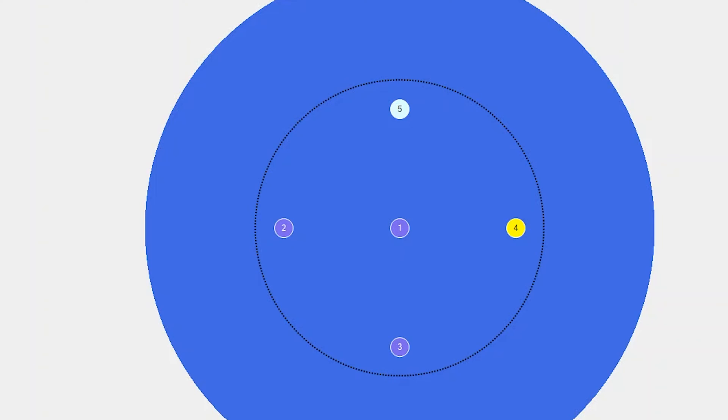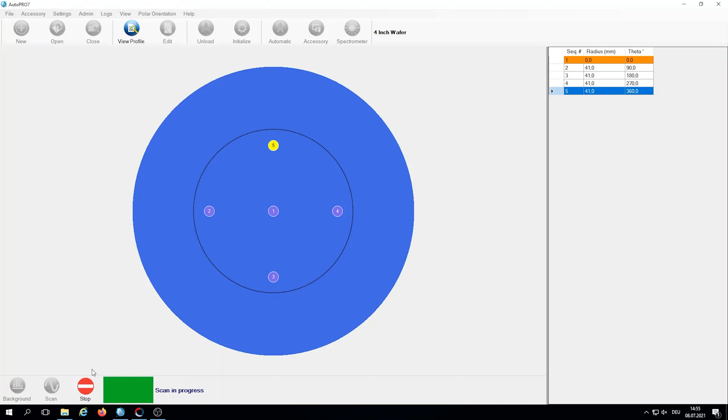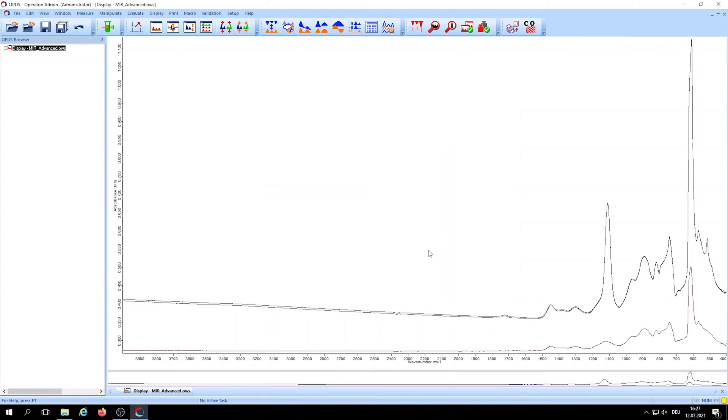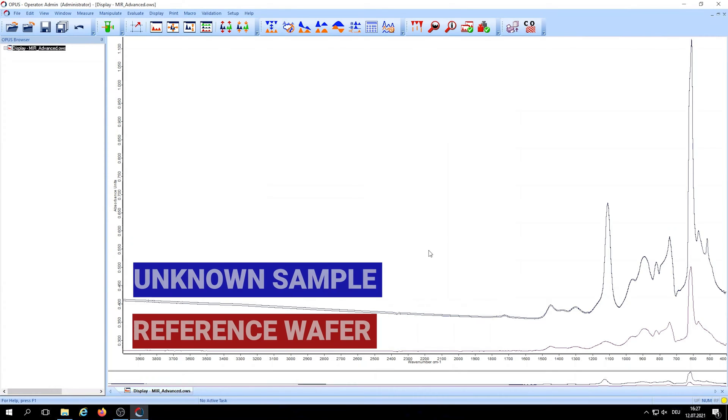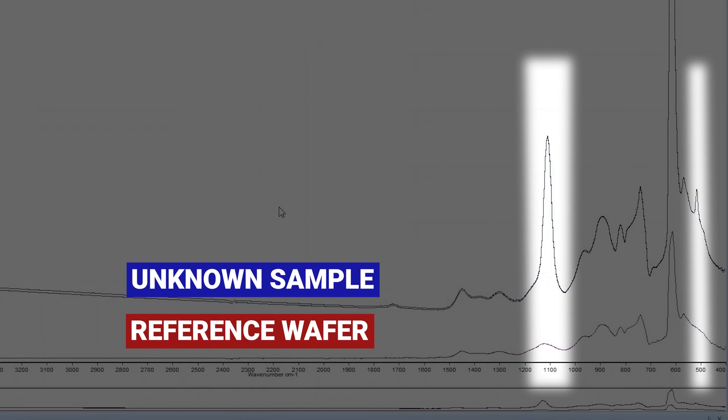The IR data for each measurement point is automatically stored for evaluation, which we can perform after all the data has been collected. We have that data here now and we can see the differences between the sample wafer and the reference.